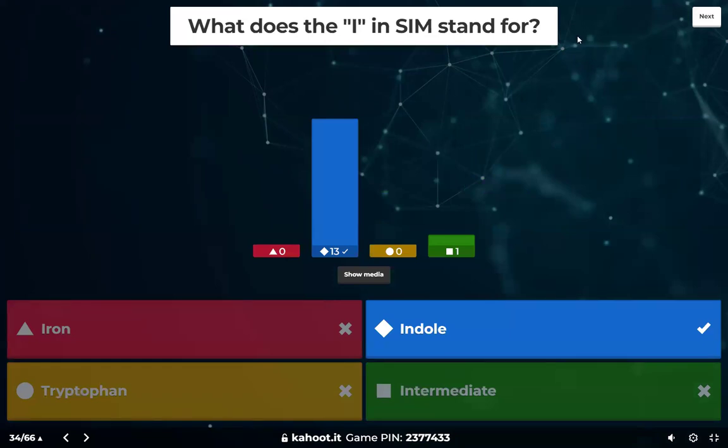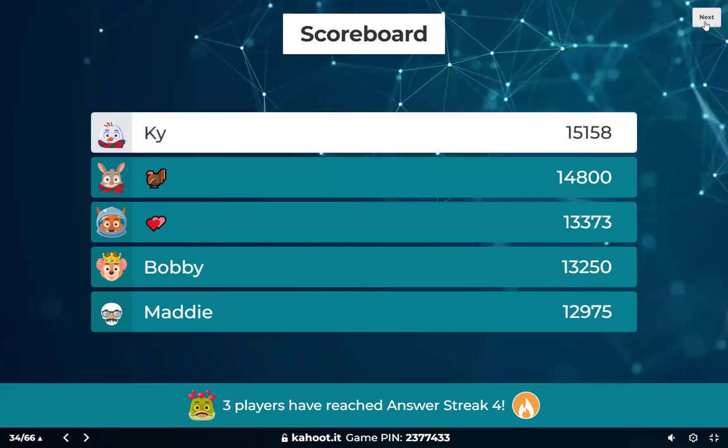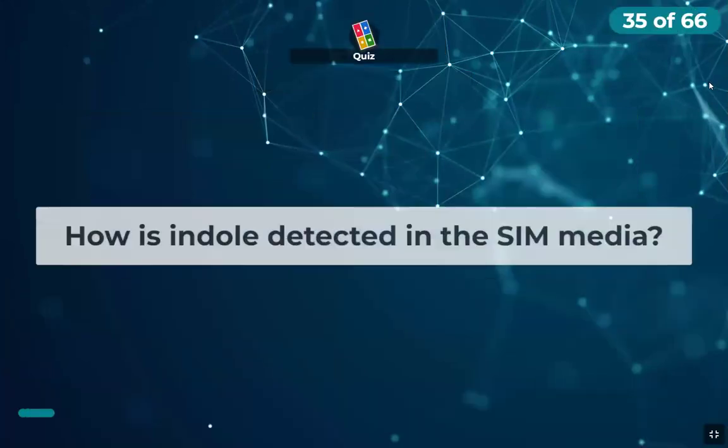We're going to talk about TSIA in a little bit, of course, but what does the I for TSIA stand for? Do you guys remember? Iron, right. And does it have iron in the name? Do you guys know what it's for? So yes, the iron is what's in the media to detect sulfur reduction. So they both test for sulfur reduction. So don't forget about that. Just wanted to bring that up.